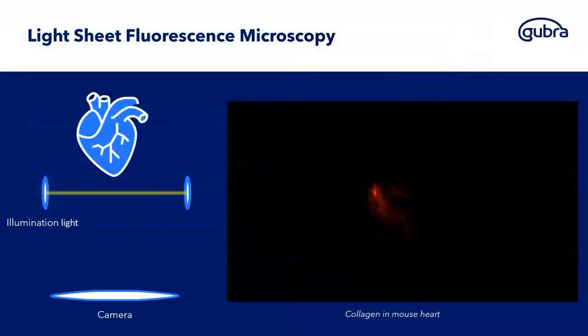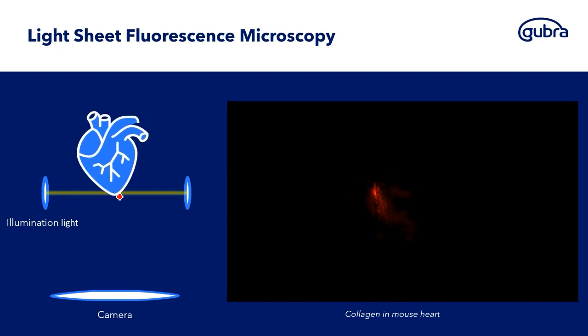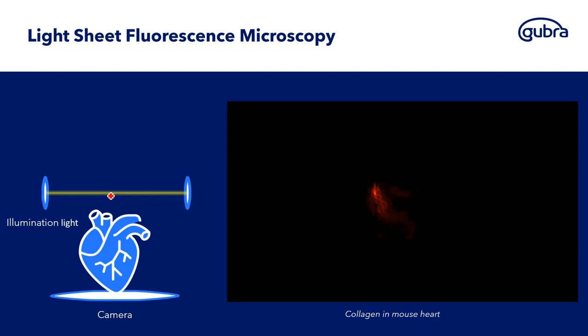So here on the first slide, I would like to explain a little bit about the imaging system that we use. We use light sheet fluorescent microscopy, and the illustration here shows a light sheet with the yellow line you see here. And when the microscopy session starts, the sample, in this case a heart, will be moved incrementally through the light sheet, and for each step we will take a 2D image. And you will see a short illustration here. And for each position, the camera perpendicular to the light sheet will acquire one image. I will now play a movie.